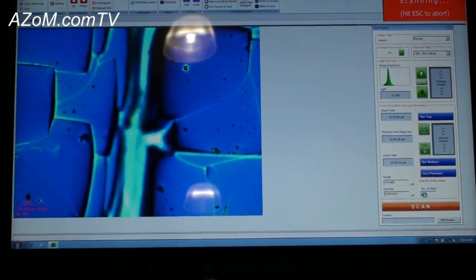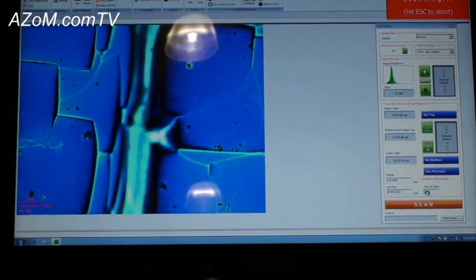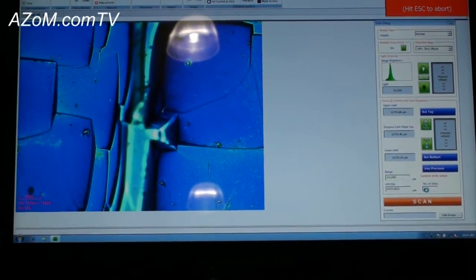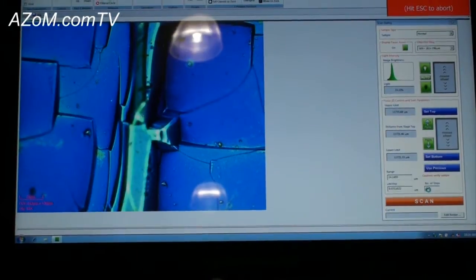At any point I can actually hit escape in the data collect if I really didn't want to run that particular spot. You can actually see the image slice that we're taking on the sample as we actually move the stage in the Z direction.